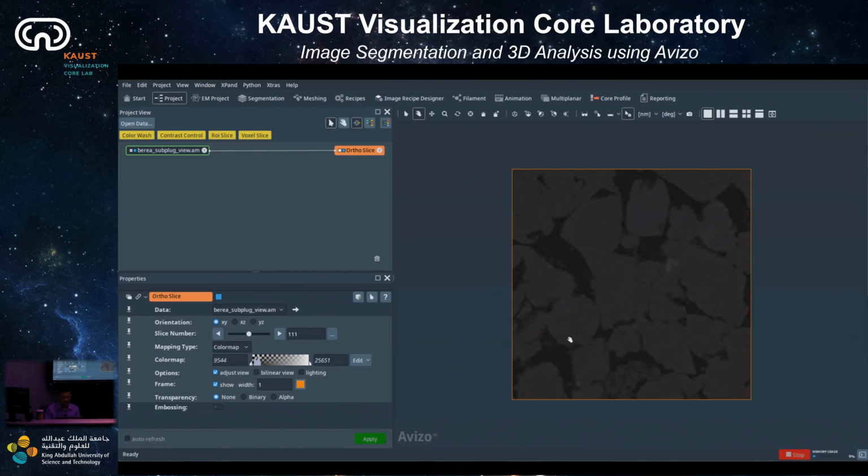And now you can see it like this. Just the easiest way: open that folder and then drag and drop into your Avizo 2024.2. Because sometimes by default they open the Amira PerGeos Avizo.